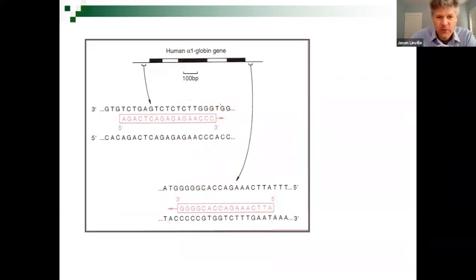When your Taq polymerase sits down, it's going to sit down here and go in this direction. And on this primer, it's going to sit down here and go in this direction.